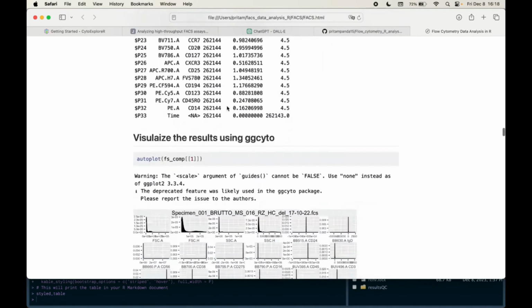I have two different HTML files. This one is the previous one I have shown, and here, if you click on show all code, view source, you get all the codes like this. You can directly copy and paste from here, or if you want to read it, you can just unfold and read.